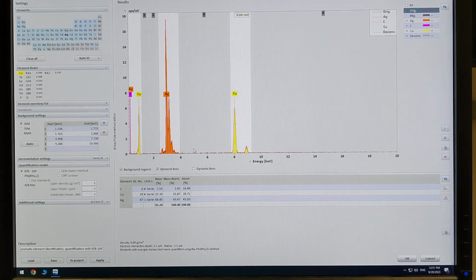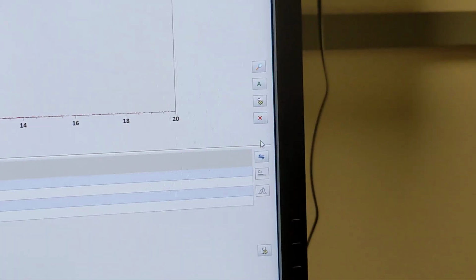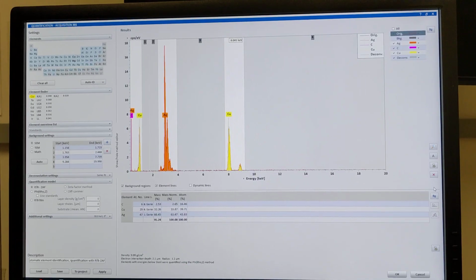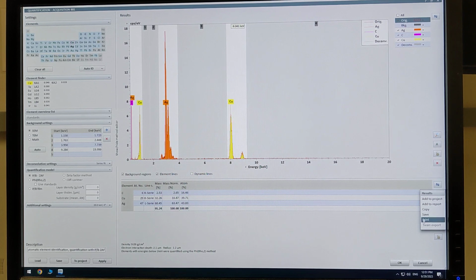All right, so let's say we're happy with this data. We would like to save this data. There's this button you see here on the lower right, the little back and forth arrows, that is the kind of universal save button. And you will see that on a bunch of different areas of the software, right? If you left click this, the results, you can do a few things.